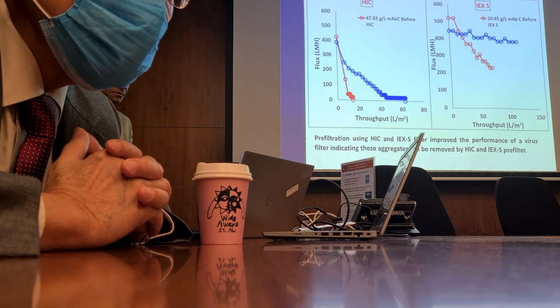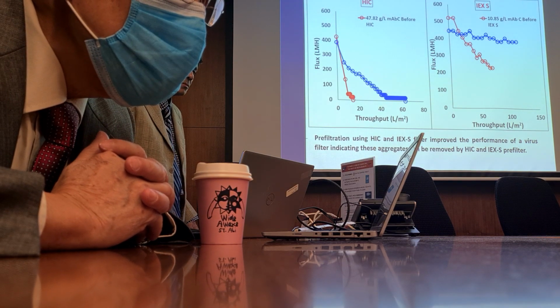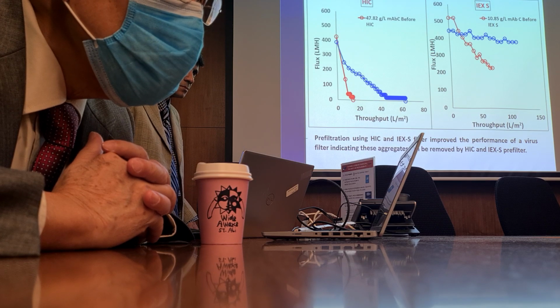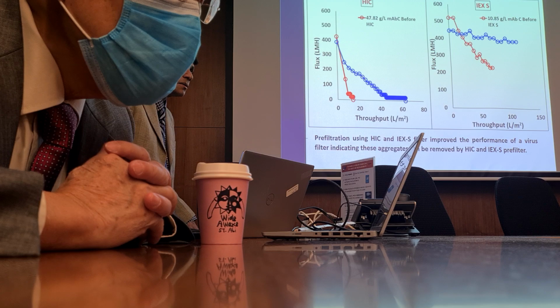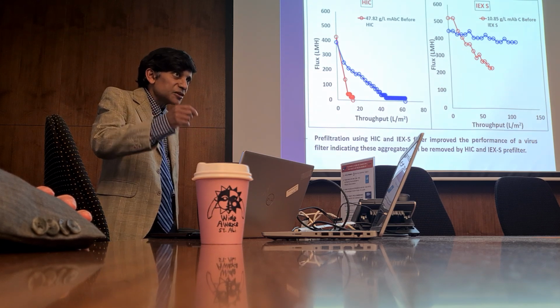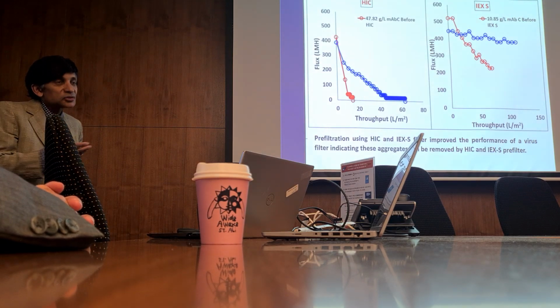Amazing presentation. I'm just wondering, when virus or microorganisms are subjected to the membrane surface shear rate, will the structure be damaged or not? It's a good question. Yes, they can be. If you think of specific proteins, if you're trying to produce a monoclonal antibody, then yes, they could be shear sensitive. So you have to be very careful about the shear rates you use.